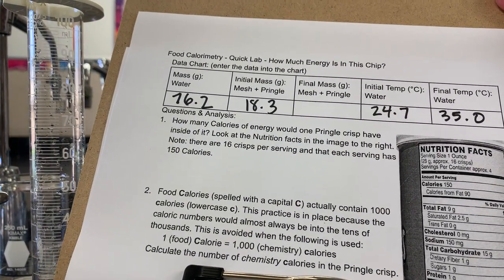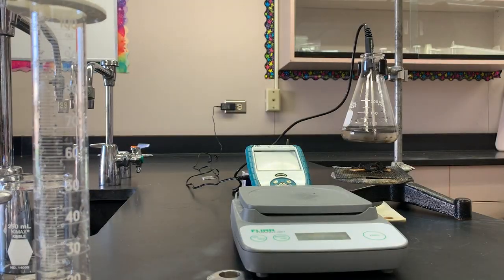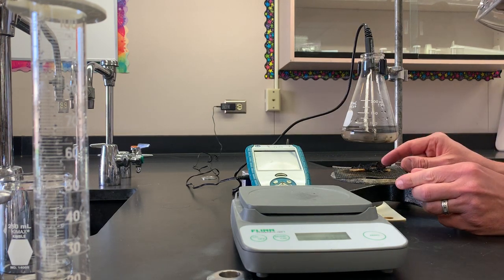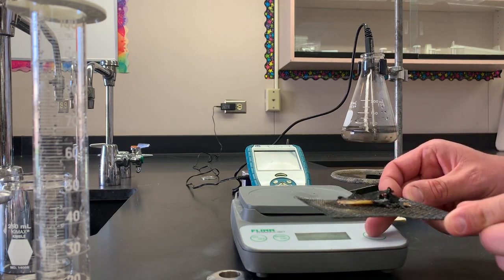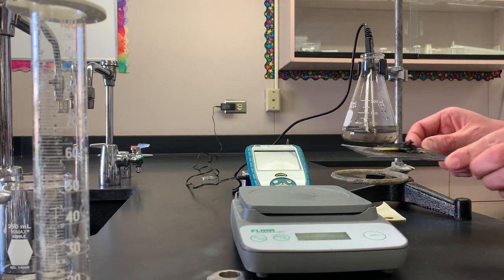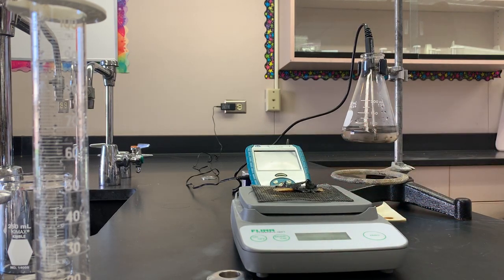We have one more piece of data to obtain, and that's the final mass of the mesh and the Pringle. It's still smoking a little bit, but should be cool enough by now to go ahead and carefully place it on our balance. I re-zeroed that balance. Placing that on the electronic balance — the mass shows 17.0.